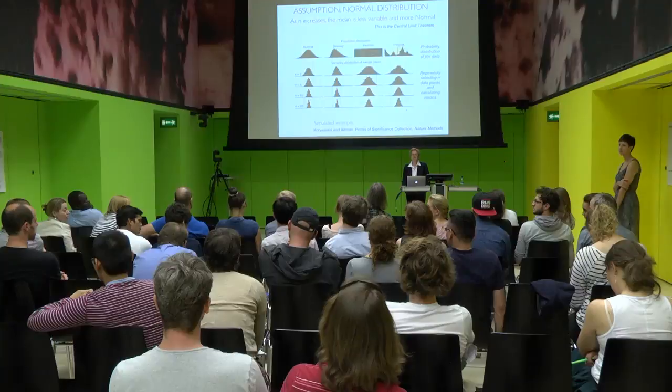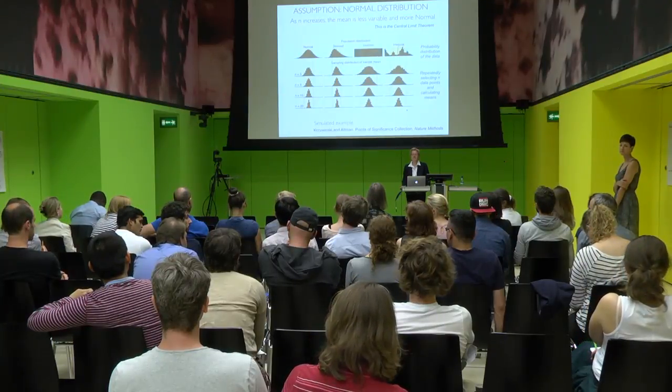Yeah, I guess that's a major concern about the diagnostic biomarker, which is they only look at the protein level changes between two conditions, which is disease or more conditions, right? As I was saying, you can actually do any linear combination of conditions. My question is, if you're looking at something like predictive biomarkers for a drug, for example, if I want to look at, say, 20 or 30 biomarker or protein changes against the drug efficacy, and to establish whether this multivariate analysis is anything that MSstats can do, or can you suggest any other software.